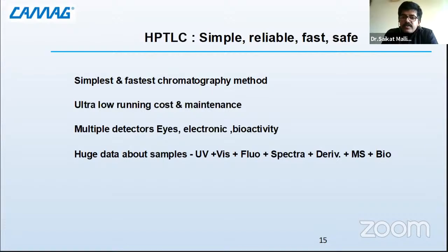Now, these data, how does the data look to you? So first of all, I give you a graph, okay? And I tell you, you have 3 points. Just plot me a graph through those 3 points. You will plot a linearity and you will get one single line. But if I give you 5 points and now I tell you, okay, plot this graph, you will see that the second graph, which is having 5 points, is more accurate because you have more data points. So the more data points help you to get more accuracy in your results.